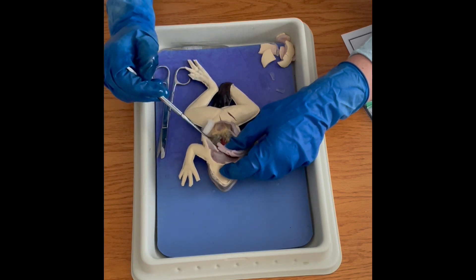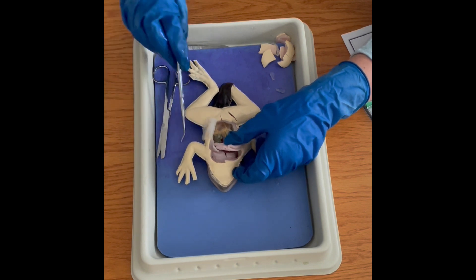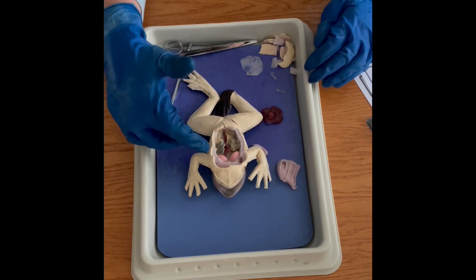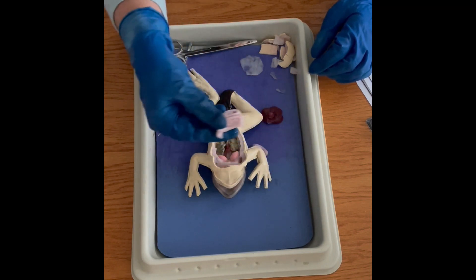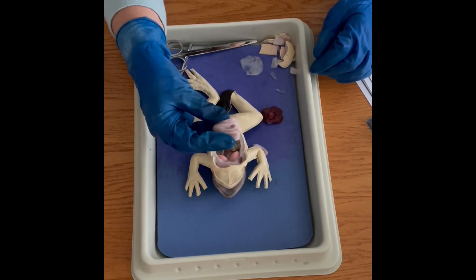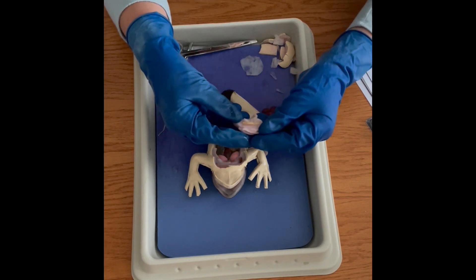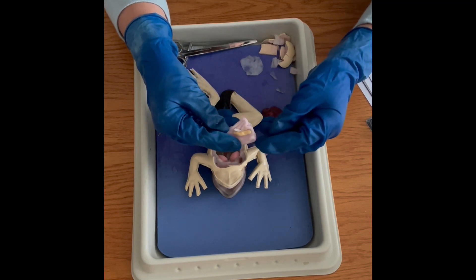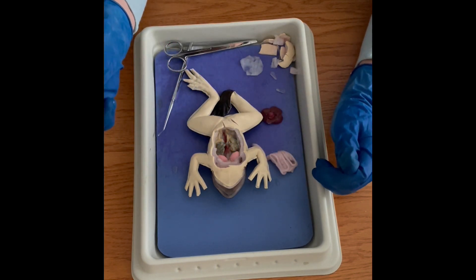I'll pull these out so we can see what else we can find in this synthetic frog. Now we have some things that you can see a little bit more easily. This is the small intestine and the stomach. The stomach honestly looks a little bit more identifiable on a real specimen, but the pancreas and gallbladder are on the back here and those are certainly more identifiable on this specimen than they are in a real one — students often have trouble finding those.